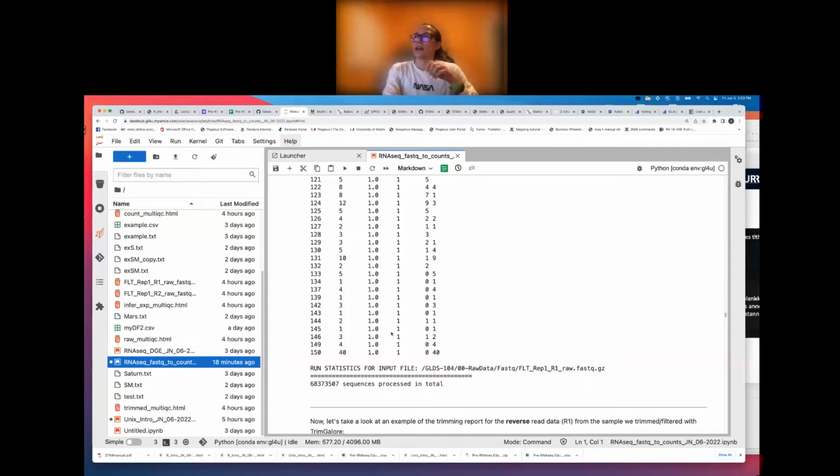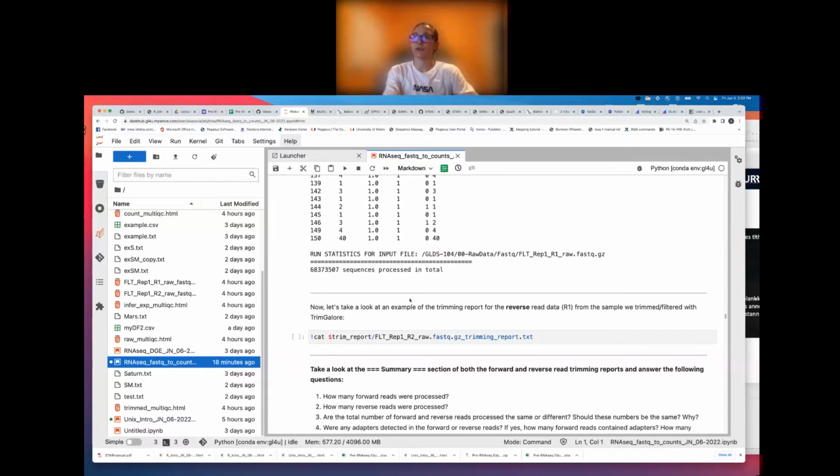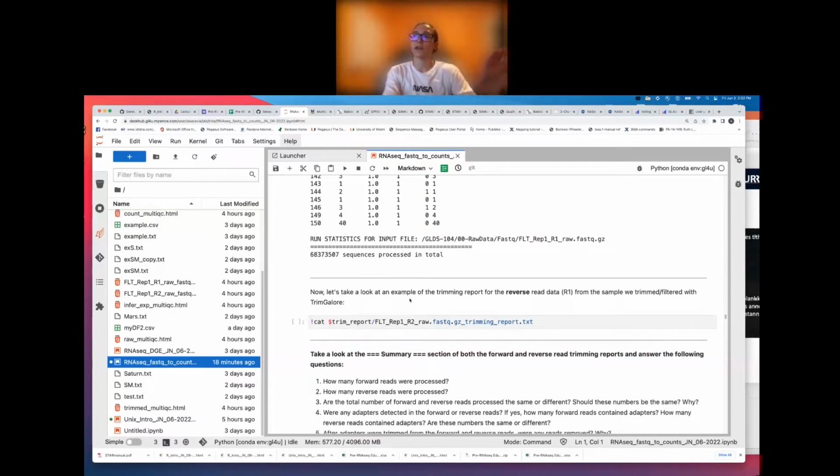And so that's why, even though some of the forward reads didn't meet the 20 base pair cutoff criteria for the read length, they're all still there after we look at the forward read, because Trim Galore is going to wait and do the trimming on both the forward and the reverse read before it does a length cutoff.